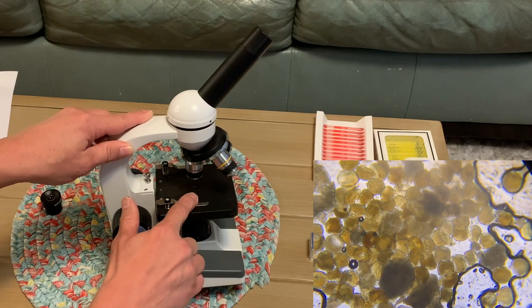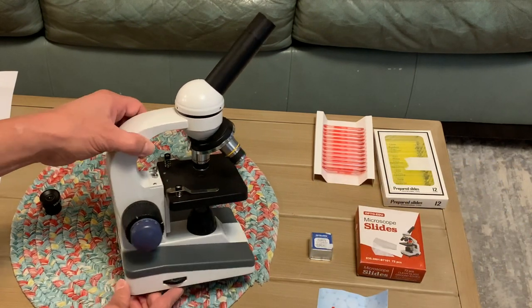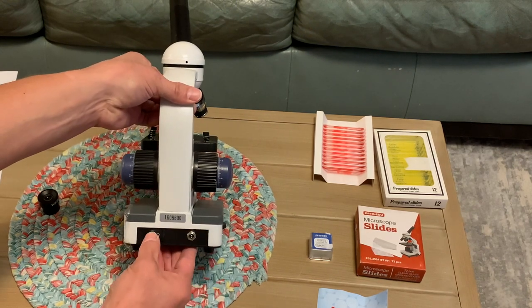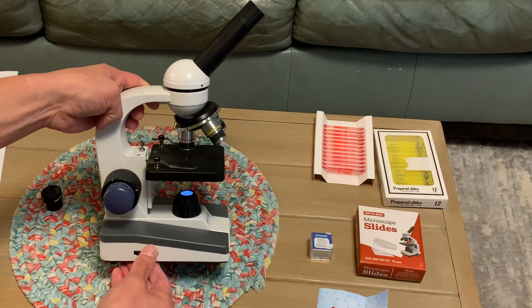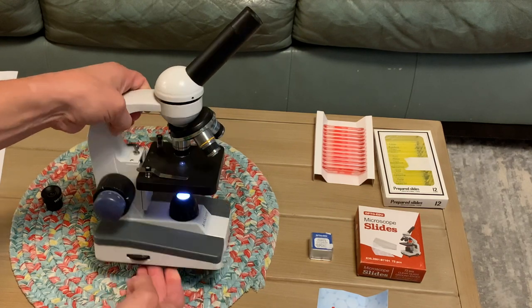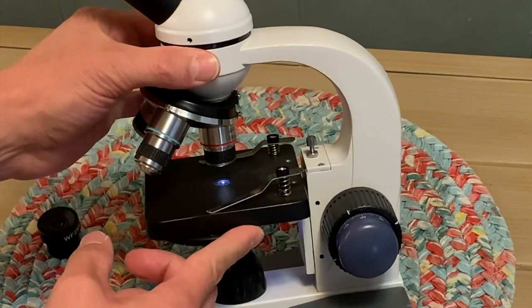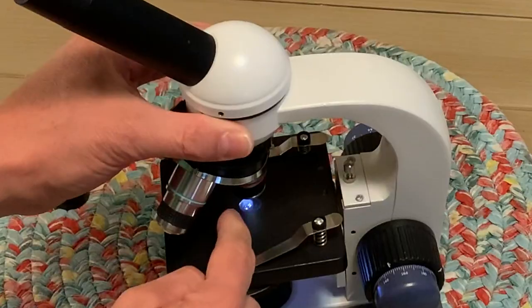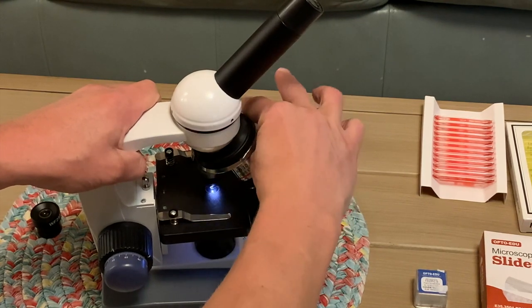These are your clips to hold your slides on, and you've also got a light with a switch right here. Once the light is on you can adjust how light or dark it is. On the other side of the microscope you've got this knob which adjusts how much light comes through, and then you've got three different objective lenses.